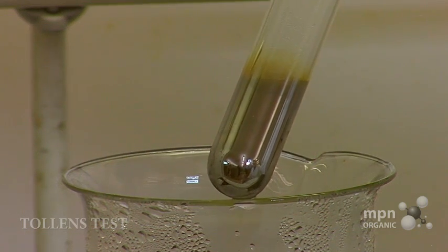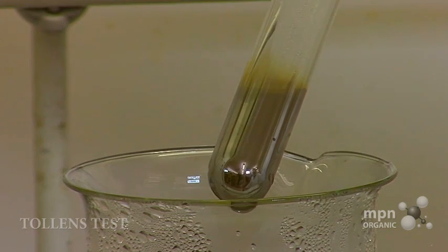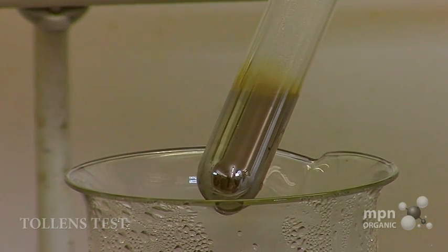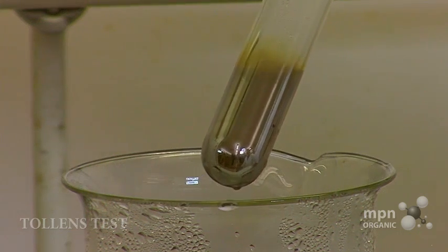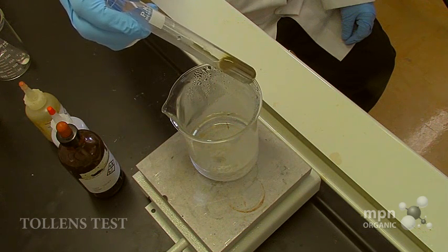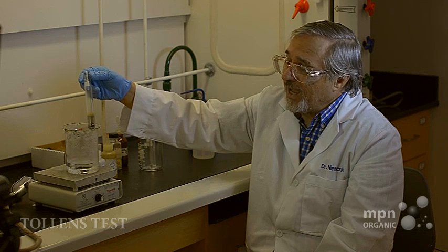What you get, then, is the interaction of the two, and you get the reduction of the silver plus one ion. And this, in fact, gives rise to the silver mirror, hence the silver mirror test or the Tollens test.